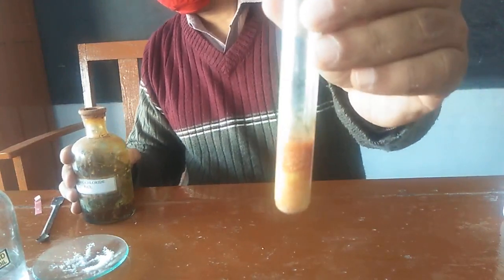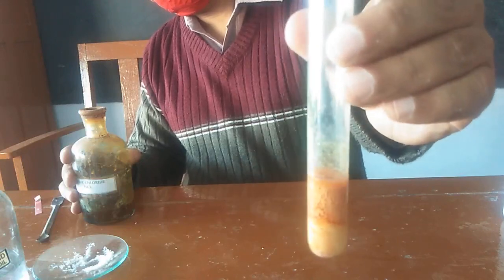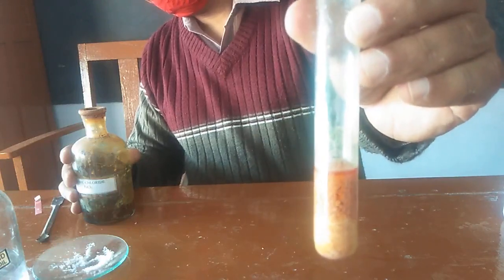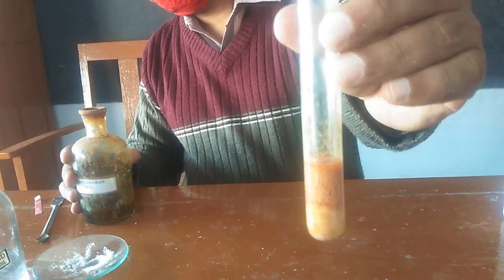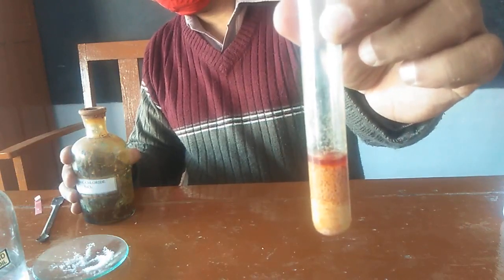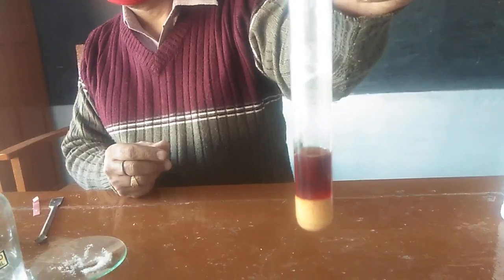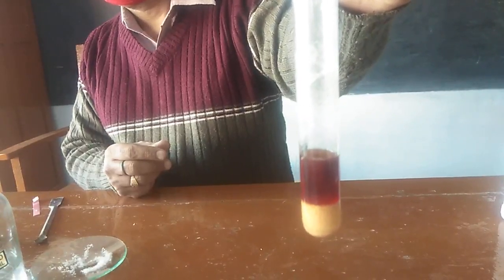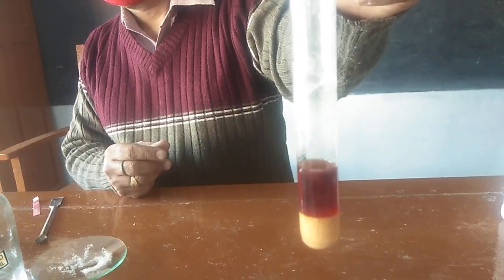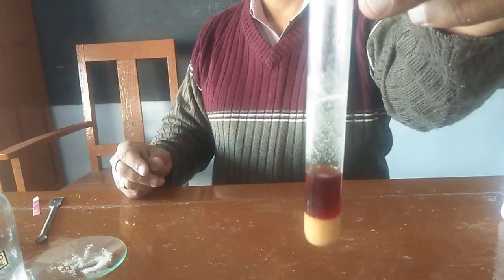You can see the change in the color. A reddish brown precipitate is formed in the test tube. This shows the presence of acetate ion in the given salt. This reddish brown coloration is due to the formation of ferric acetate.